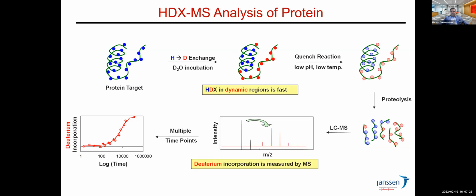This picture illustrates the steps of the HDX workflow. We start with a hydrated protein in solution, where the blue dots are the backbone amide hydrogens. When we mix our protein of interest with a deuterated buffer, these backbone amide hydrogens gradually exchange for deuterium. After a certain exchange time, we are going to have a partially deuterated protein, and then we can stop the exchange reaction by lowering the pH or the temperature so you can quench the reaction, as seen where the colors of these dots become a little shaded.